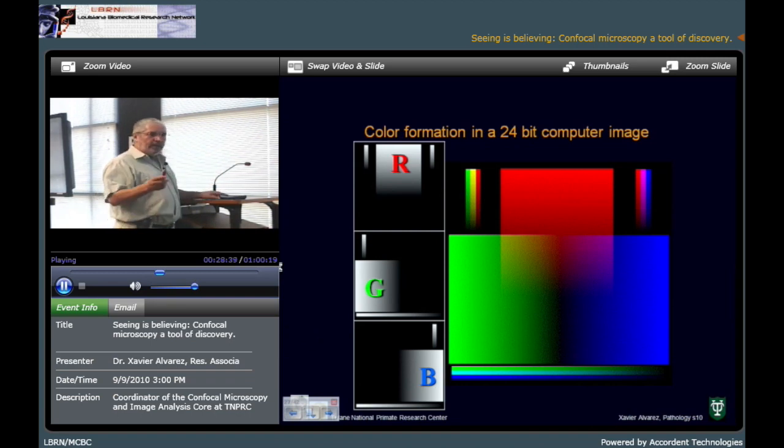The reason I mention this is that sometimes people ask, where are you getting the numbers from? Every single picture that we capture has numbers, and you could do things with them, like counting pixels, counting cells, and doing associations of one with the other.